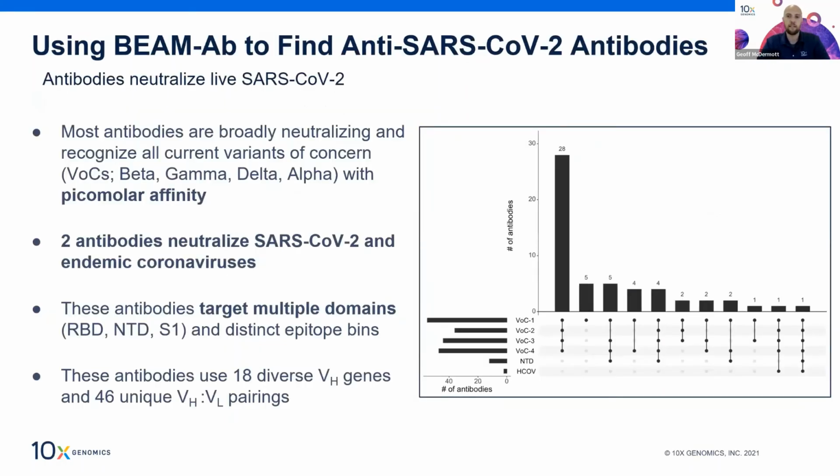So on this last slide, let's jump back into that large SARS-CoV-2 antigen data set that we saw a couple of slides ago and take a little bit of a deeper dive into that data. So first of all, keep in mind that B-cell receptors can bind more than one antigen because of the variable region maturation. So the epitope that is recognized by the B-cell surface receptor may have common binding to multiple antigens, basically. The 5 barcoded SARS-CoV-2 antigens mapped in this patient's serum are shown in the horizontal bar chart. And then if the isolated B-cell contains sequencing reads for a given antigen, the circle is colored black, and the vertical bar chart itself is just the number of times this B-cell configuration is counted.